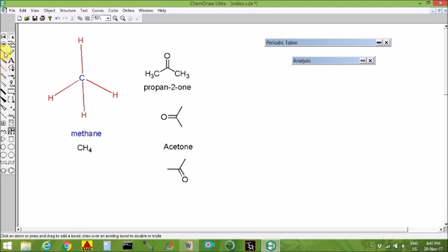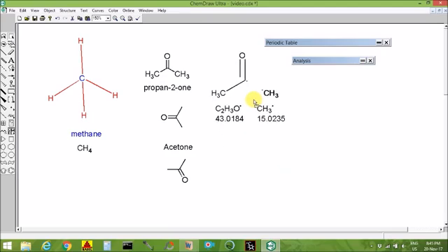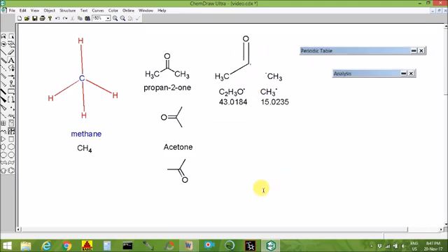Okay, let's see about this mass fragmentation tool. For this I am taking this acetone as an example. I will copy and paste this structure and also enlarge this. Okay, now go to this mass fragmentation tool and drag over this bond. Now 2 fragments are generated along with the molecular weights. So like this we can identify the possible fragmentation, and this will be useful for comparison with mass spectra fragmentation peaks. Okay, now I am going to take another example, benzaldehyde.